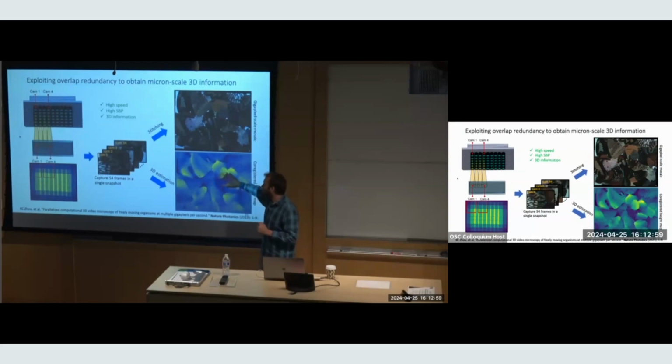And so you really want to solve for the 3D height and stitching at the same time, right? When you need to do both. If you don't need to do both, then just solve for the one you need to do. But we need to do both. And so this is not a new area either in software and computer vision. This problem is called the photogrammetry problem, or the solution is called photogrammetry.